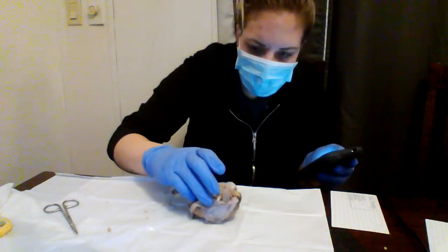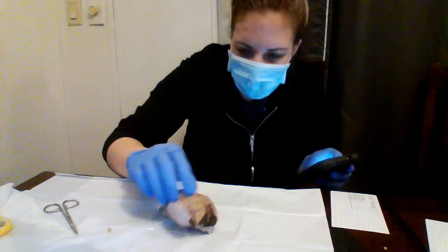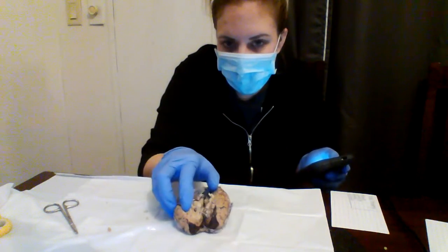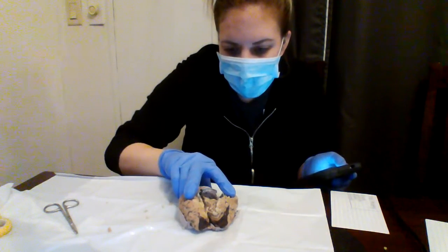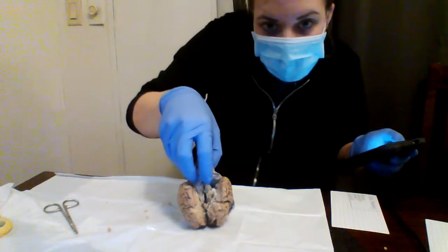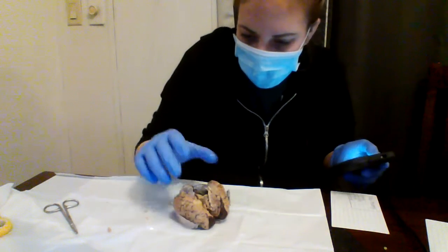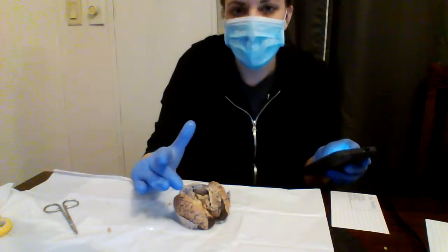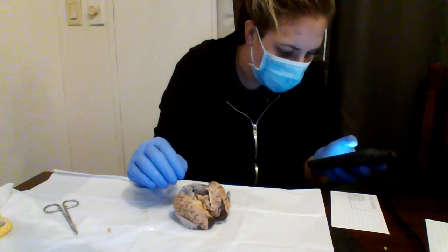If we were to turn it to this side, we have a couple of things that are more towards the inside of the brain. I cut it open. It's really hard to see, but I cut it when I was doing the dissection. I sliced it open so you can see the pieces of it in there. So this is just basically your half of a brain. I just kind of tore it a little bit so you could see more in there.